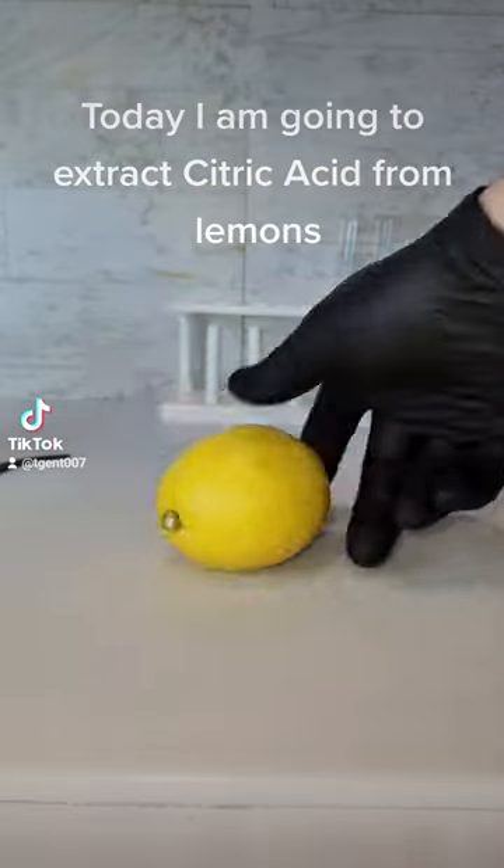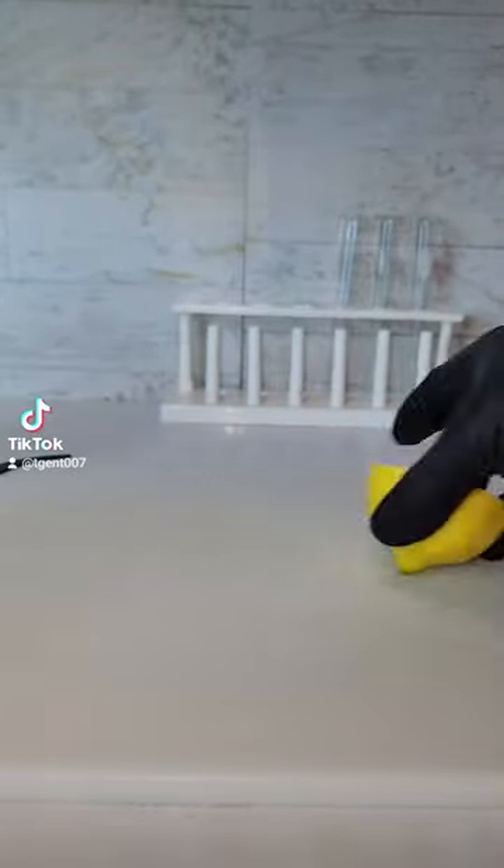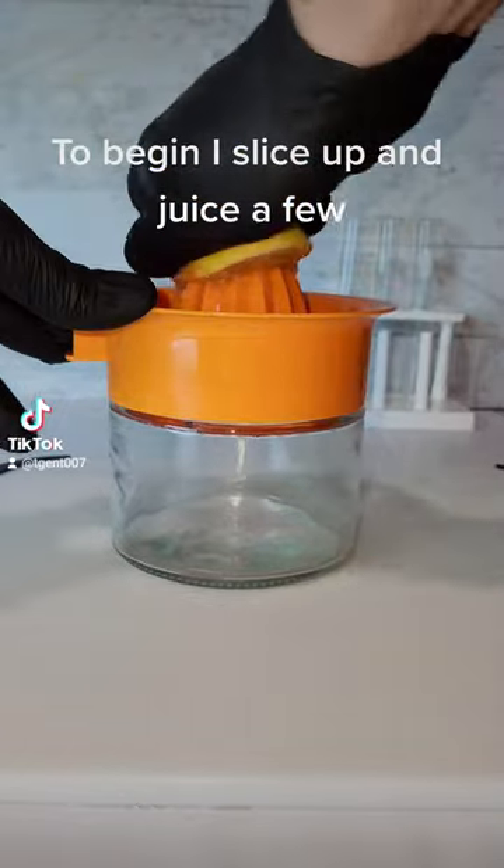Today I am going to extract citric acid from lemons. To begin, I slice up and juice a few.